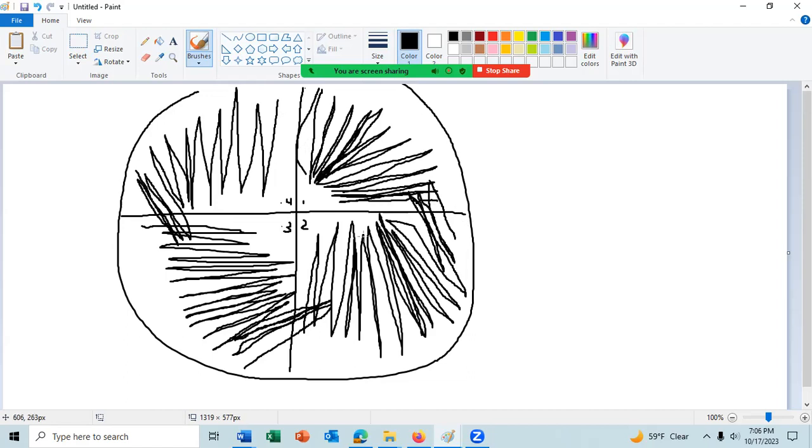Like when I'm coming here, that was pretty close to quadrant 1, but it didn't pick up any cells. And this is done correctly, although right there, I'm really close to quadrant 2, but I didn't pick up any cells.